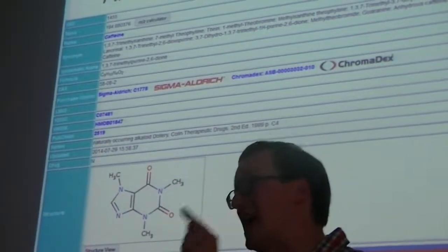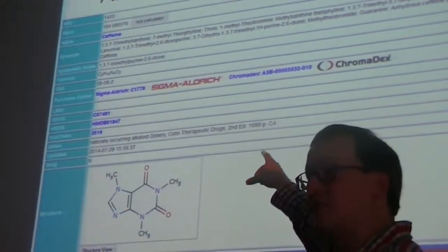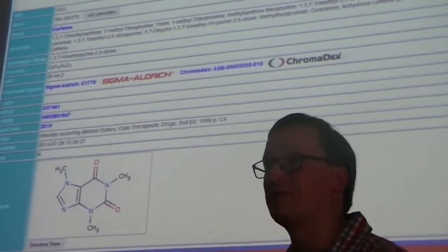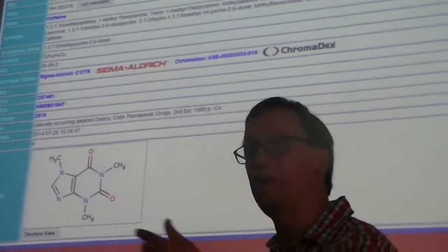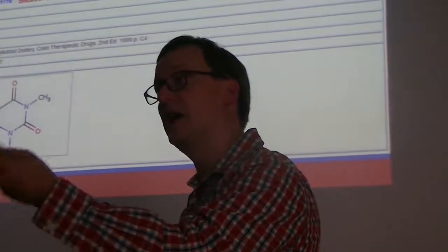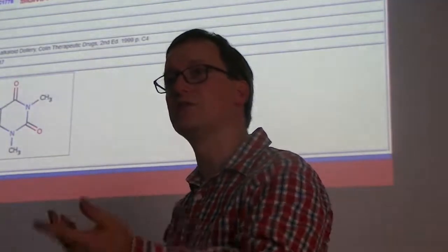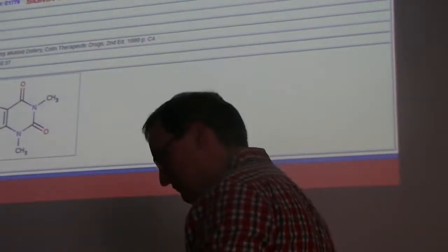Remember that I said this was an academic corporate partnership. So when you do a search in the Metlin database and you get back a compound, if these companies sell it, you're given a direct link to their website to do the purchase. So this is sort of the payback, right? When you engage in corporate research as an academic institution, there's going to be expected to be some degree of reciprocity. They don't just give you something, they give you something so that you can feature their product, and this is part of that relationship that's come from here.